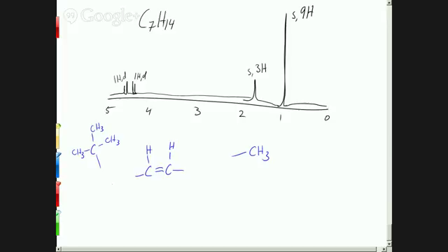Okay. So how are we doing now on our atom inventory? Have we accounted for 7 carbons and 14 hydrogens? We have, I think. So that means we've probably found all the pieces. And there's only one way to put them together. You see that? If we need all 3 of those pieces, there's only one way to stick those pieces together. You just have to connect them, because they only leave us with particular connections.